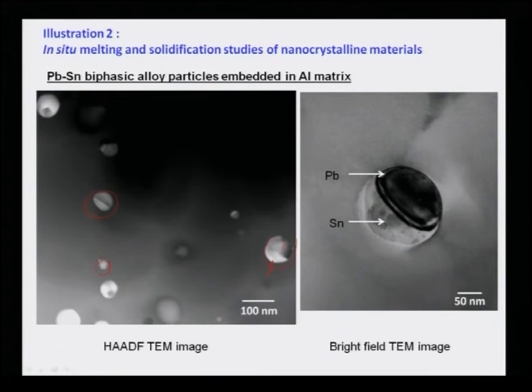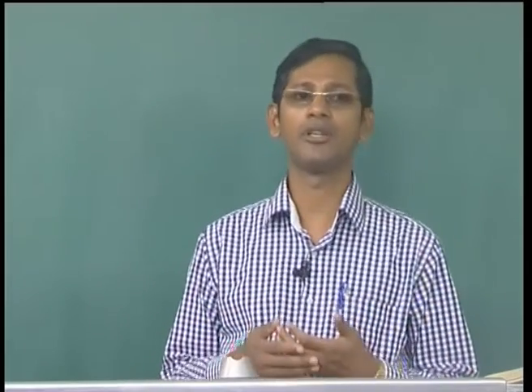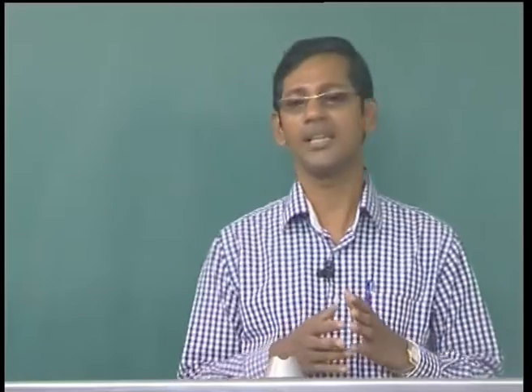If the specimen is very sensitive, one should not use STEM in a FEG gun, but rather use a LaB6 filament, where the intensity of the electron beam is normally low. So, the use of STEM depends on the type of material. If the material is good and stable, you can go ahead with the normal FEG microscope in STEM configuration and obtain all kinds of information. If the material is beam sensitive, you cannot do it, so you have to change to the normal microscope.